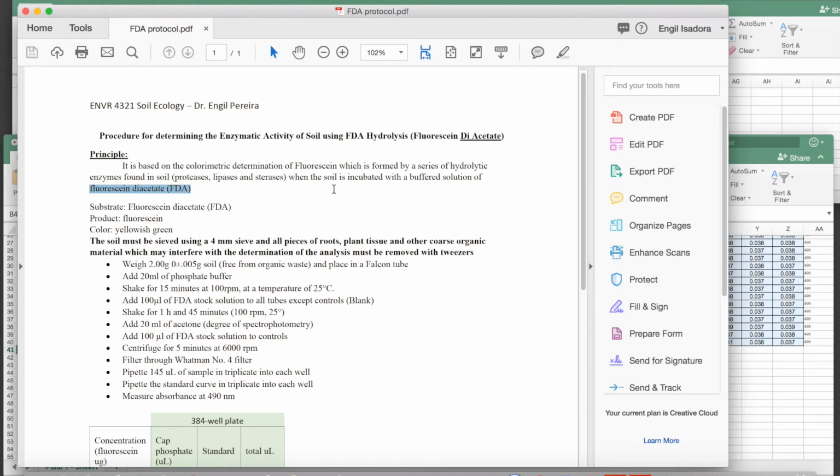And then in the laboratory, we used the samples each group collected. We added the reagents, substrate, we made a standard curve. So we're going to calculate how active the microbes are based on the speed they break down fluorescein diacetate. All right, and the more active they are, the brighter the color they're releasing in those tiny little wells we're working.